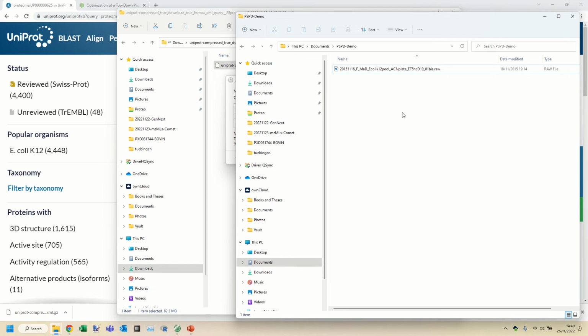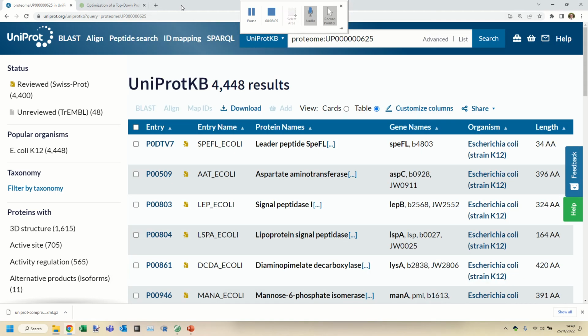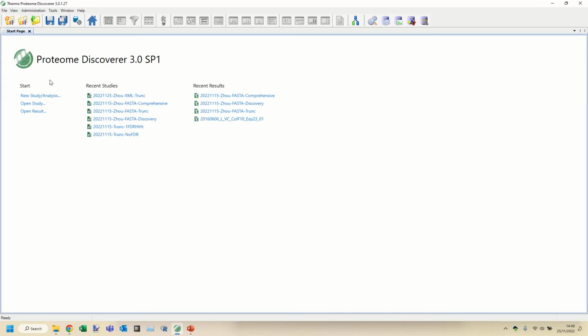Now, it's worth noting that in ProSight Proteome Discoverer, the process of setting the post-translational modifications and the sequence database come together, and they are separate from the search. I'm really very unsure why the system is being so troublesome about simply copying a file from one place to another. I'm simply going to call this a Microsoft thing and ignore it. So now we see that the file has in fact joined this other one in the file. That's great. So let's now launch Proteome Discoverer.